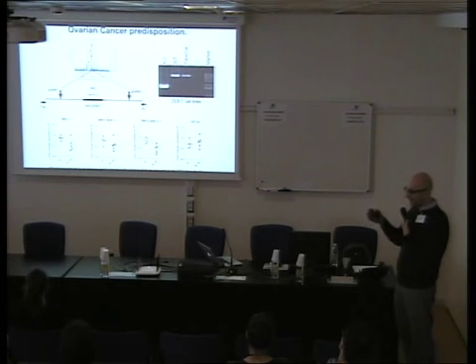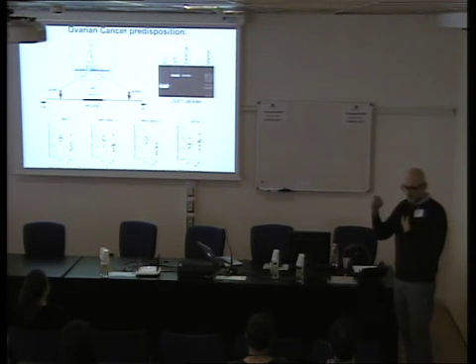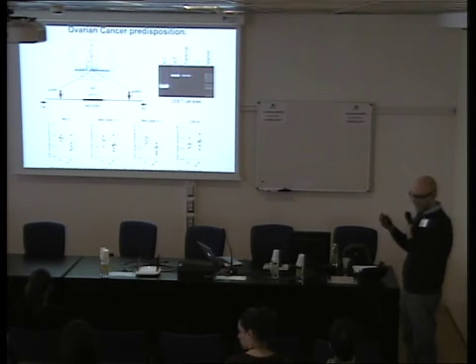That was a mark that in that clone, the CRISPR was active, generated a double-strand break, and the mistake here and here was a mark of the Cas9 and guide RNA action.